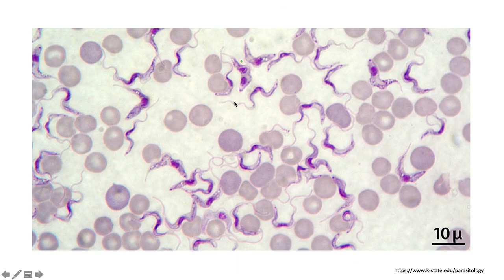Okay. This is the trypomastigotes under the microscope by the Giemsa stain. This is the blood film. And thank you very much.